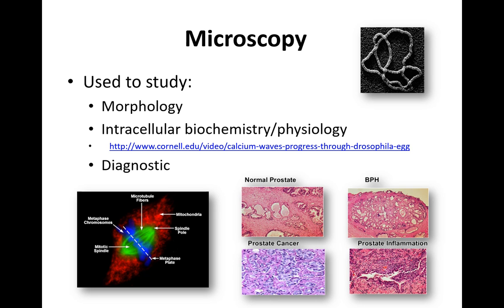We used to use it in the lab where I did my PhD, for example, to look at changes in calcium concentration. I put a video there, a very cool example, of how you can see the wave of calcium progressing through a Drosophila egg. It's not done in my lab. And then finally, it can be used for diagnostics.